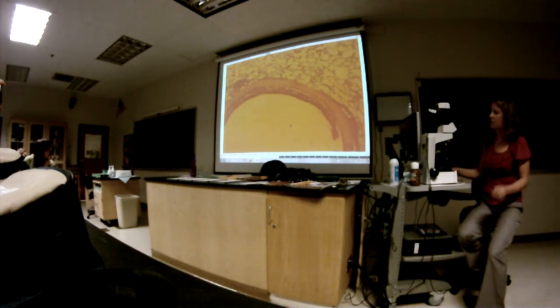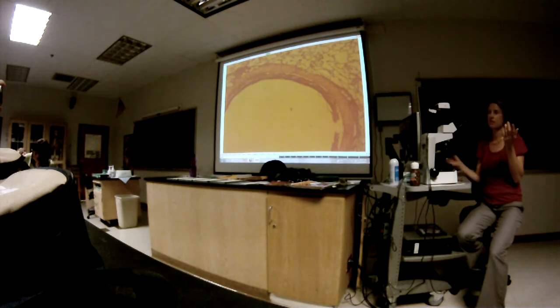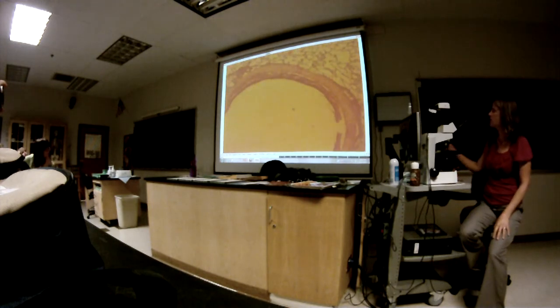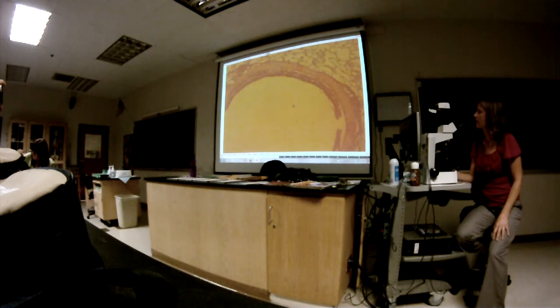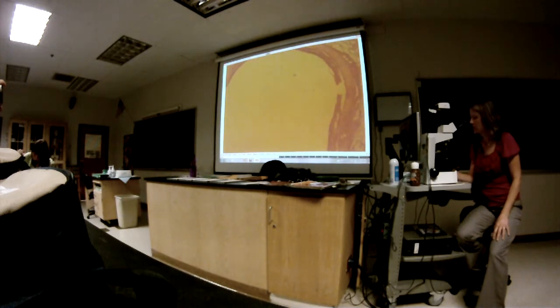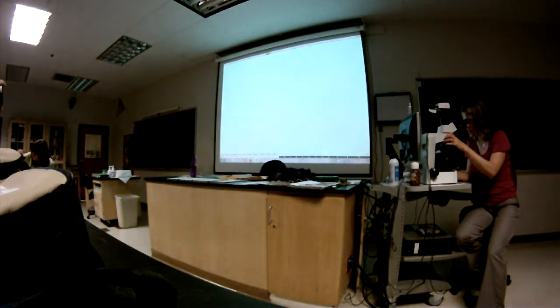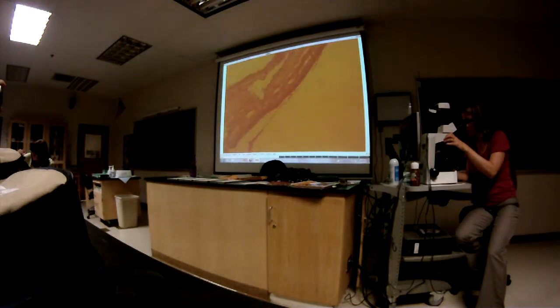How do I know that's not the trachea, though? Because of the alveoli. Yeah. Does the trachea have alveoli around it? Nope. Got to be a bronchus. If you see hyaline cartilage and alveoli around it, it's got to be a bronchus. Okay, and there is smooth muscle in there. There should be. Just not really liking this example.